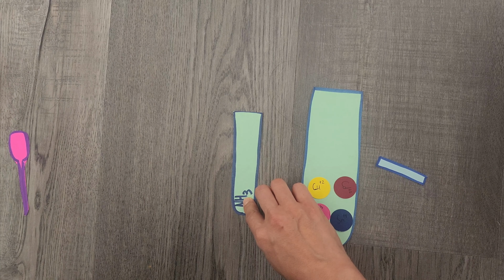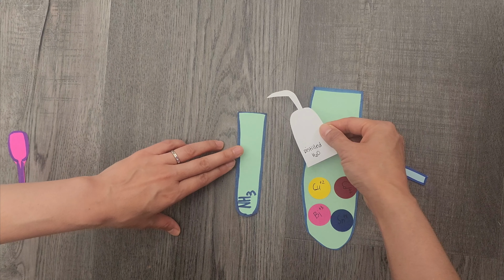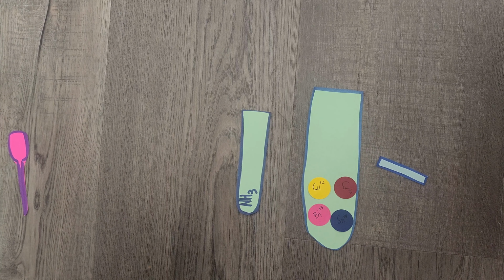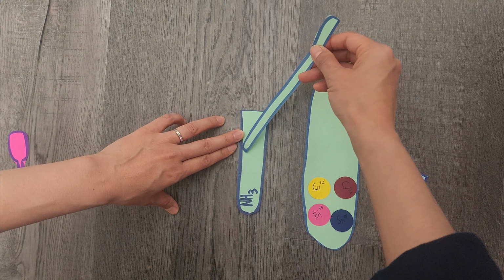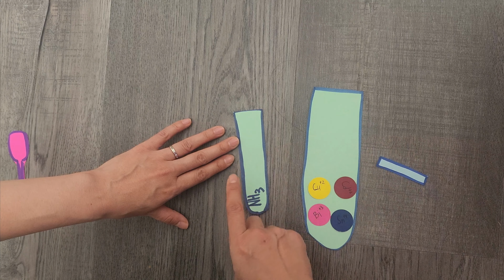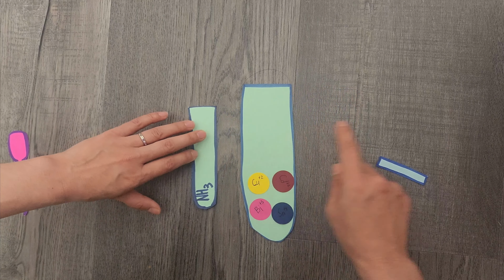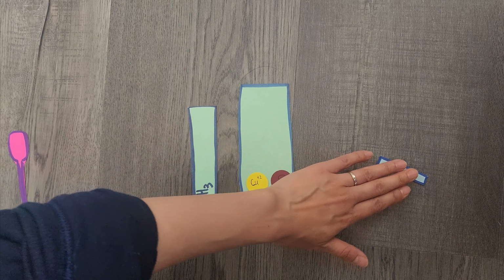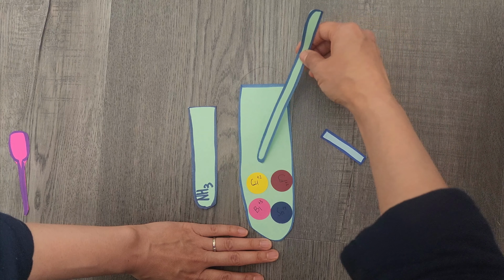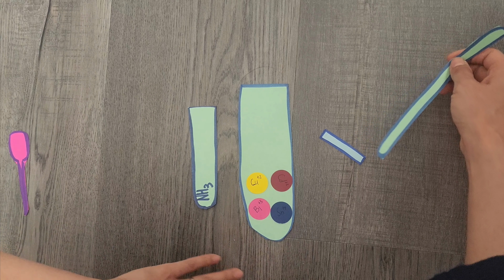And then you'll take 36 drops of distilled water. So I have my distilled water right here. You have the distilled water bottle, and you put that in here. And you mix, and you get a pipette, and you will go ahead and drop this into this test tube, drop by drop, so that once I retest with the short range pH paper, it will become somewhere around 0.5.